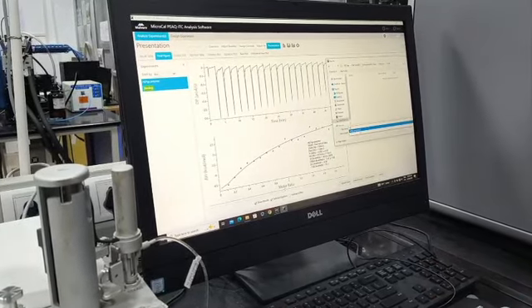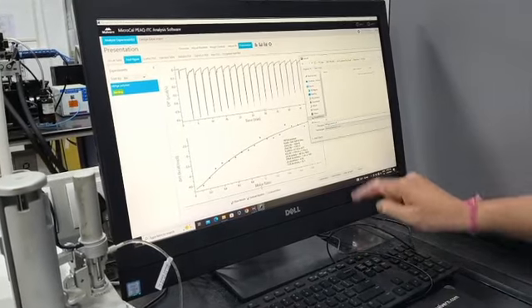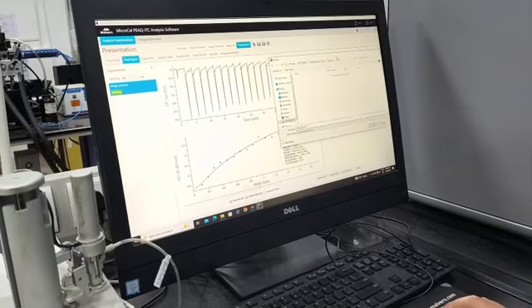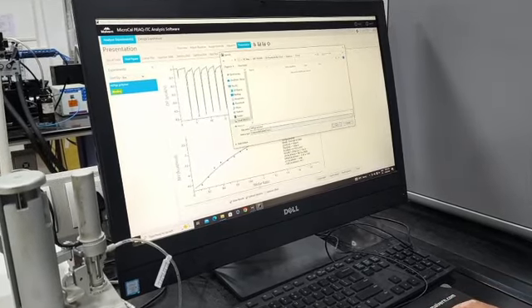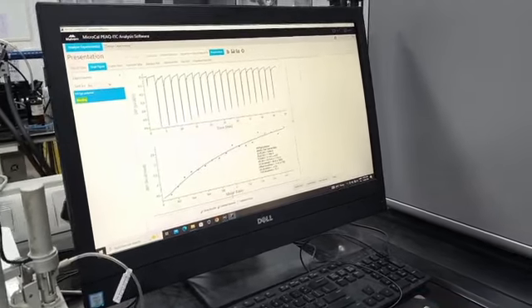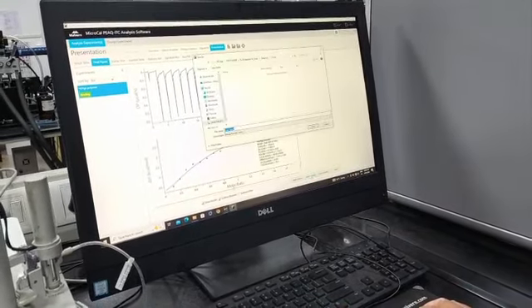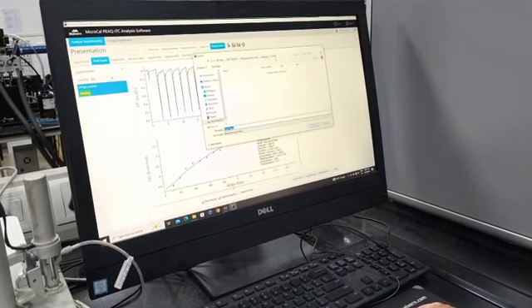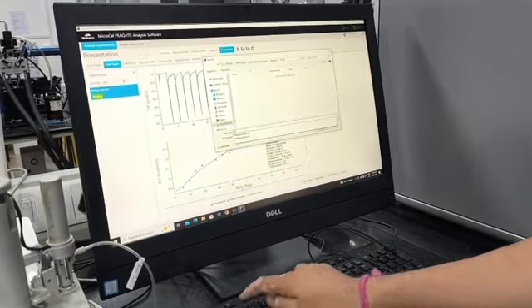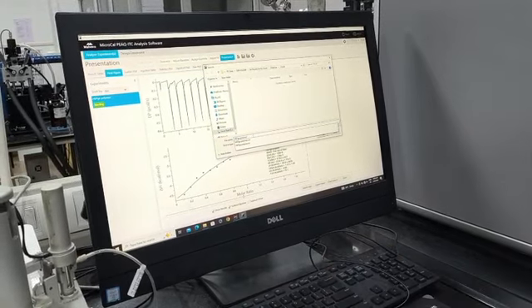HEPGA polymer ITC. So remove this extension dots, you want to keep it in .csv, so just remove this extension, so .csv, and then save. Done. First thing first. Then next, this as image, so export image. Again the same thing, this is the folder and again HEPGA, right, this one, remove the extension.